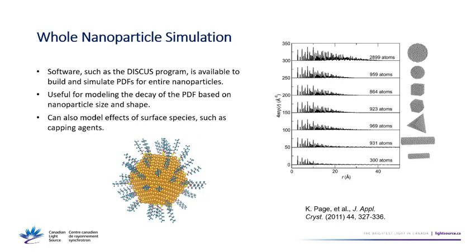And you can also do other stuff where you have a single nanoparticle. Like you can put capping agents on top of it, and you can simulate how that's going to add into the PDF as well and what its effects are.